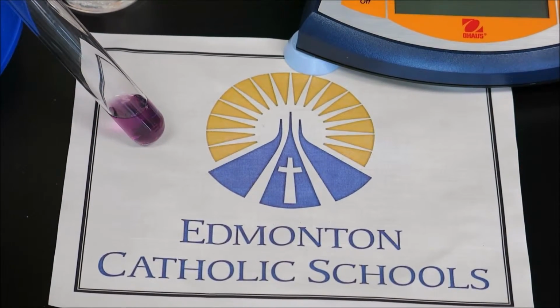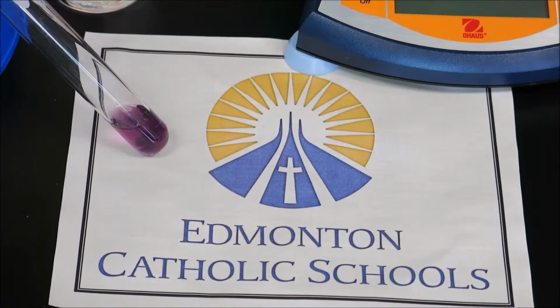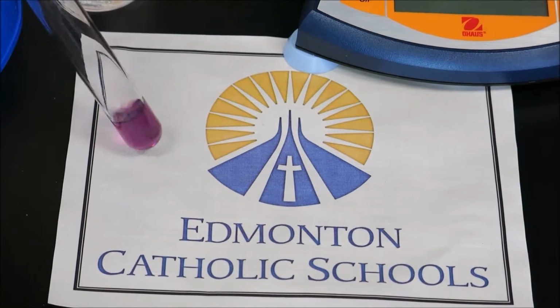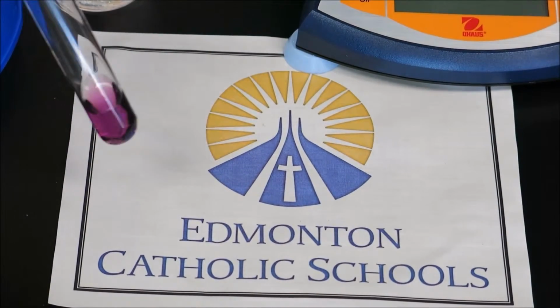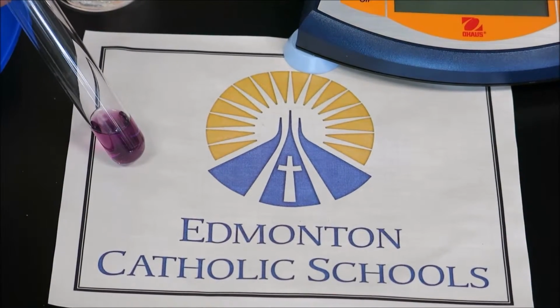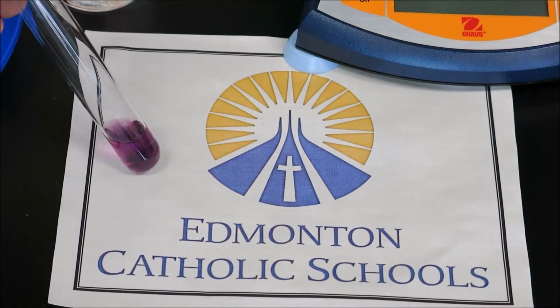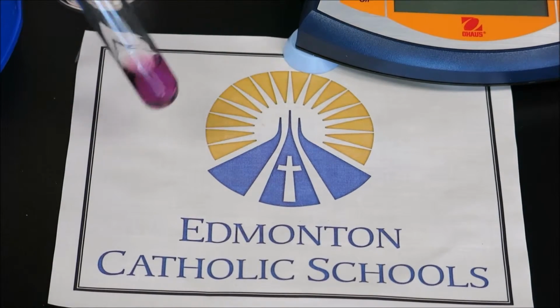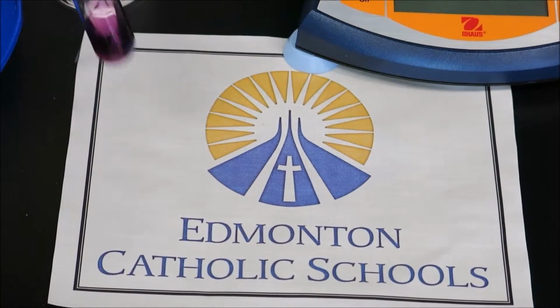Now, the actual description of the color is entirely up to you, as long as we understand the purple here is a blend of both reactants and products, the blue and the pink states. So this here is called our control. Now, this is not a controlled variable, this is a control. A control is going to be something that is unchanged. We are not actually going to add any variables to this system, and it's unchanged so that we can compare any of our tests to the original sample. So this is going to be our color comparison when we stress the system.